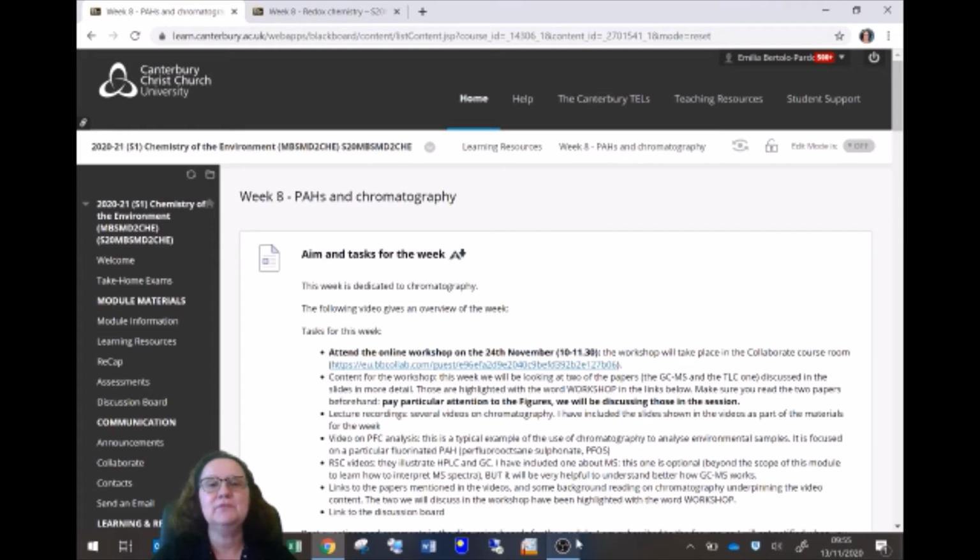Hello everyone. The aim of this video is to give you an overview of the content we will cover this week. This week we are going to be looking at chromatography and the use of chromatographic techniques in the context of environmental analysis, focusing slightly, although not exclusively, on analyzing polyaromatic hydrocarbons, PAHs.